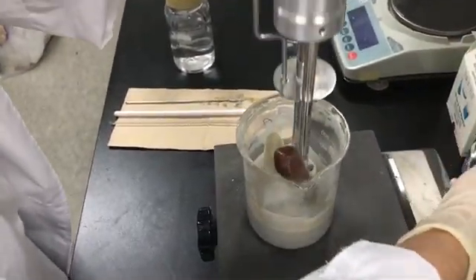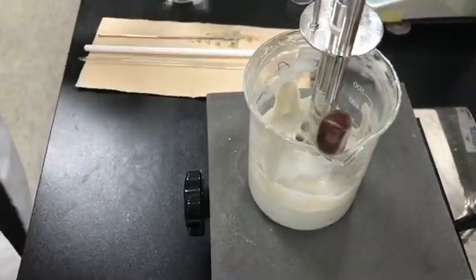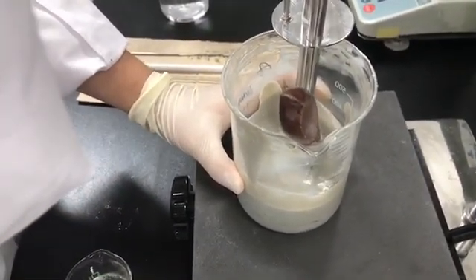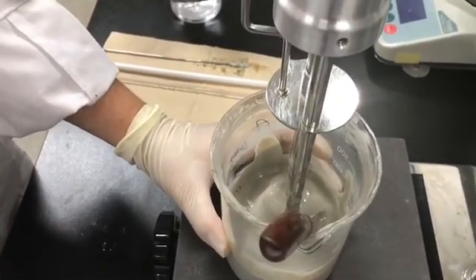Then adding FES-D into the beaker. Be aware of not using too high an RPM, because it causes bubbling during the formulation process.